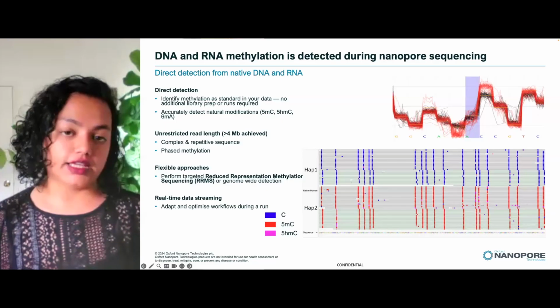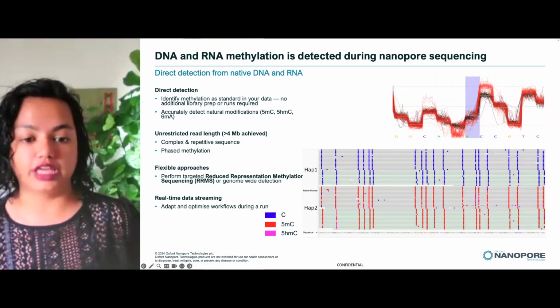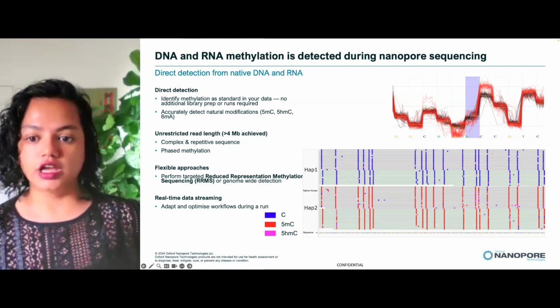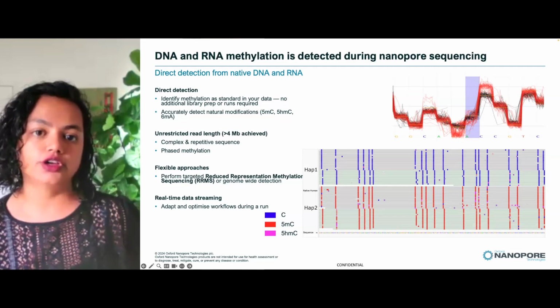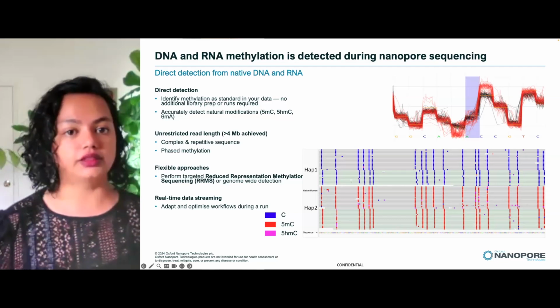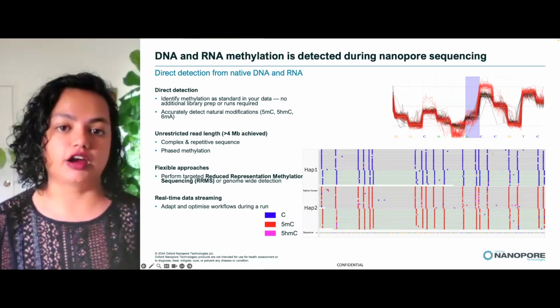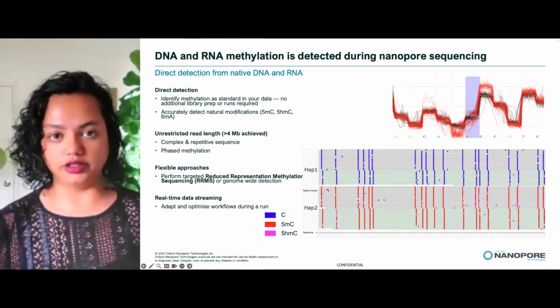Traditional methods for detecting DNA methylation rely on either chemical or enzymatic modifications. One commonly used method is bisulfite treatment, where unmethylated cytosines are converted into uracils, thus allowing the differentiation between methylated and unmethylated cytosines. This process is usually followed by PCR amplification and then sequencing to analyze the methylation patterns.